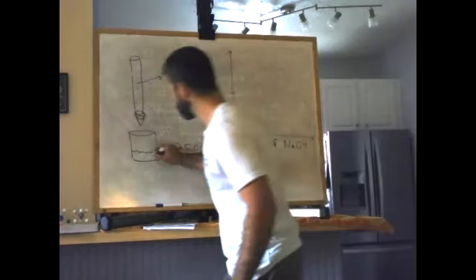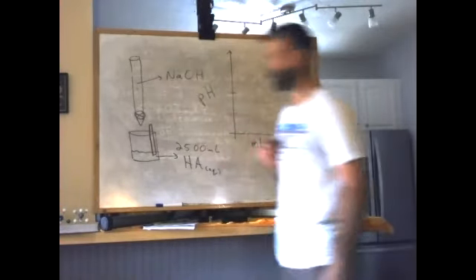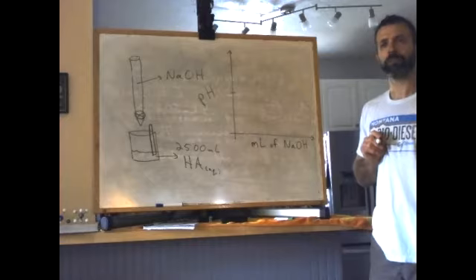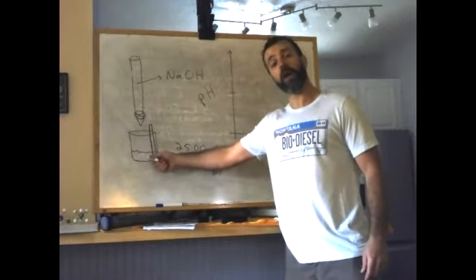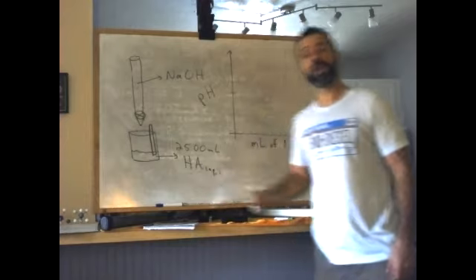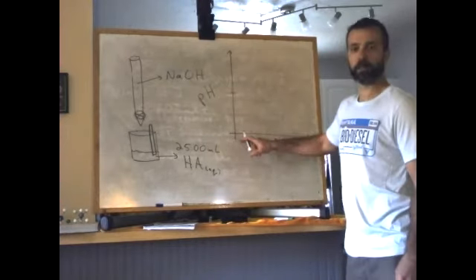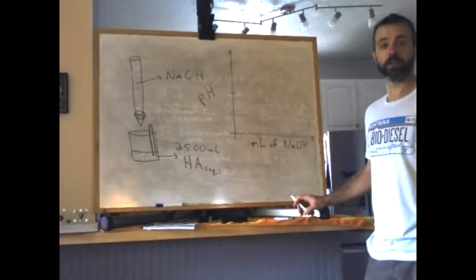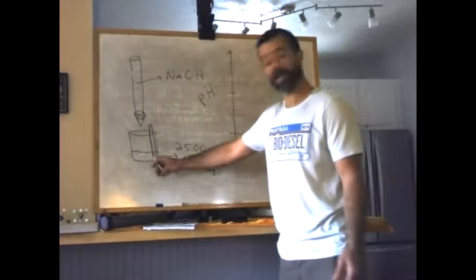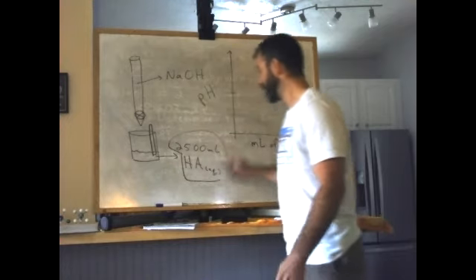Remember, the pH meter is always down here. We're always measuring the pH of this solution. Okay. So we have to think about what's floating around in this solution and what the pH of this solution is going to be. All right, so what would the y-intercept be? That would be the pH before any of our base is added. Well, before any of our base is added, what's the pH? It's just some amount of a weak acid.